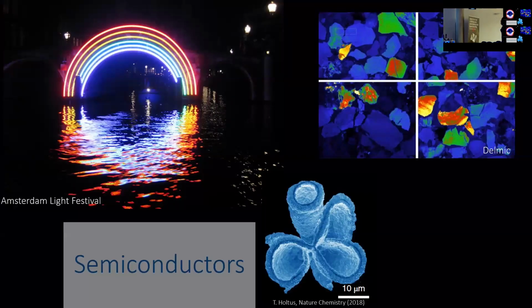Absolutely. So the width of your plasmon in EELS is going to be completely connected with your damping. So you basically can go back to the lifetime of your plasmon by measuring the width in your EELS spectrum. But that's assuming that the damping of the plasmon is dictated by the resistivity of the material. But there are other channels of dissipation, I guess, no? Or not?